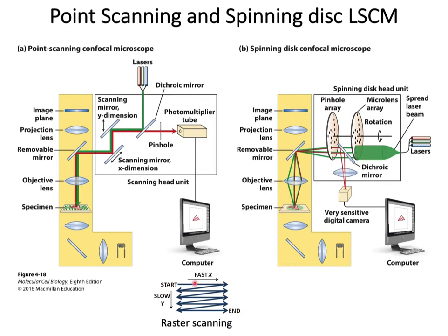So what do we achieve from this? Remember that for a single point being scanned by the laser, only that point will emit the fluorescence, which will pass through the dichroic mirror and the data will be recorded. Only that one point being scanned receives the laser excitation for the emission of fluorescence. All other points are completely dark and there will be no background fluorescence. In addition, if any background out-of-focus light is emitted, the confocal pinhole will eliminate it.